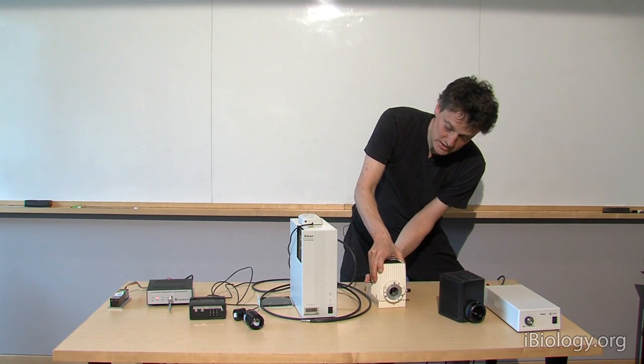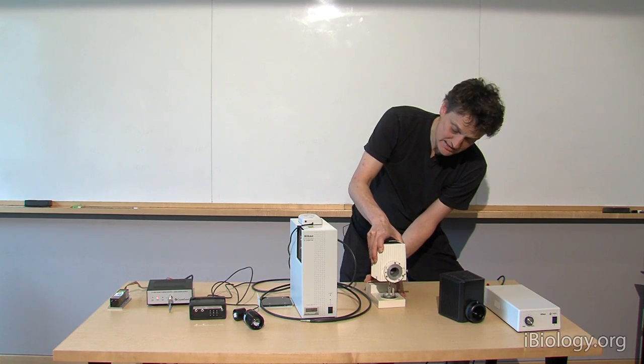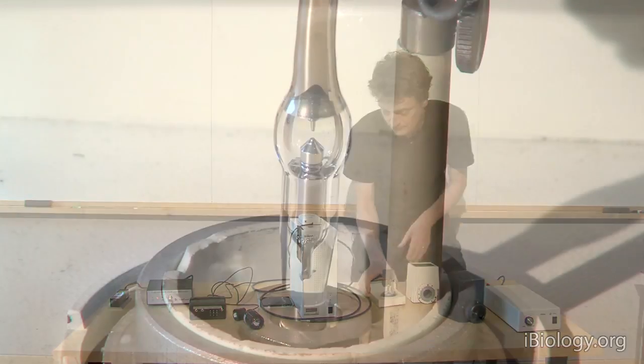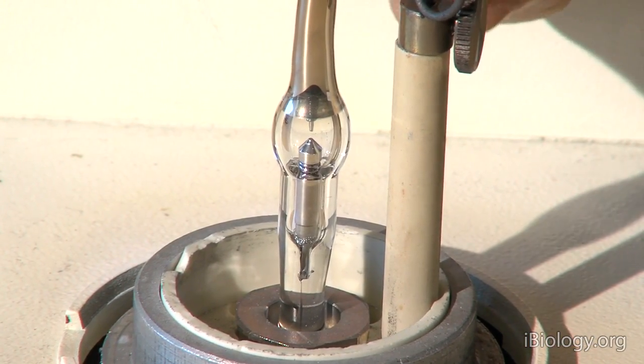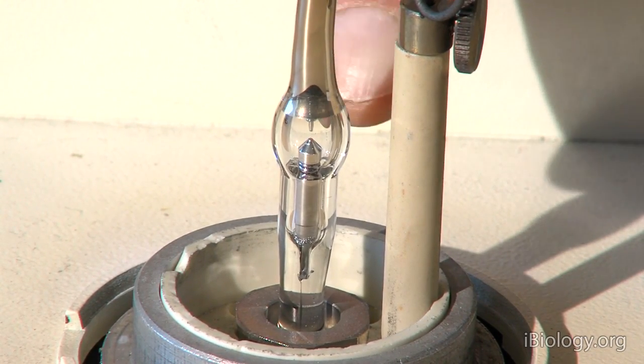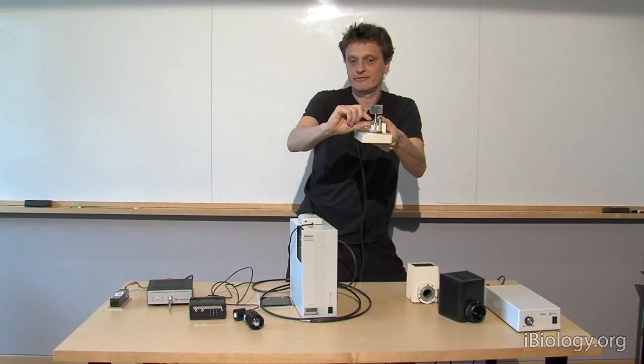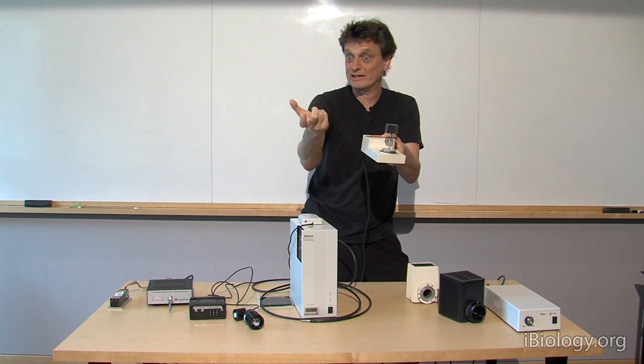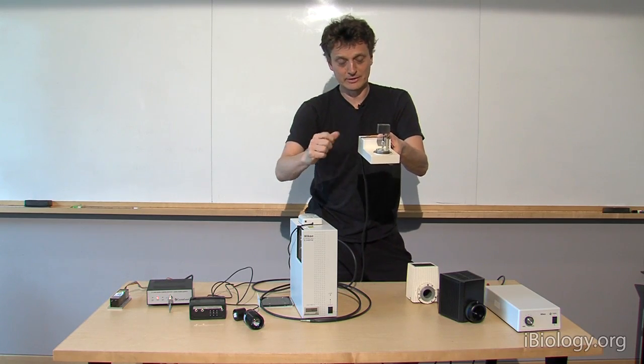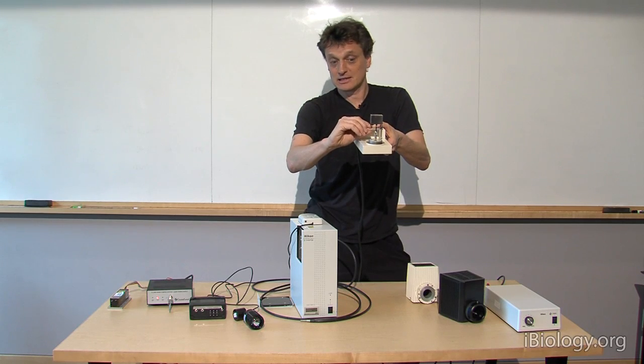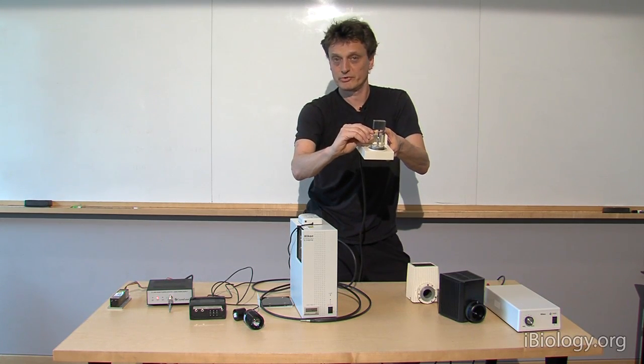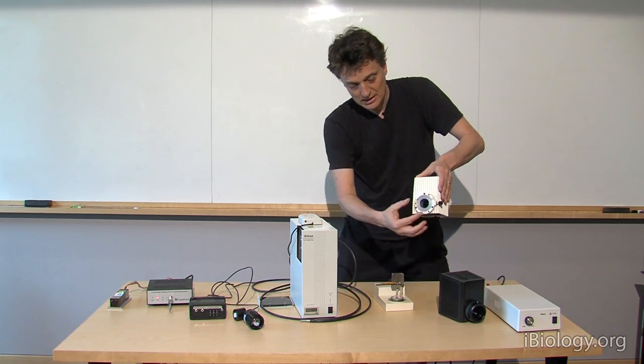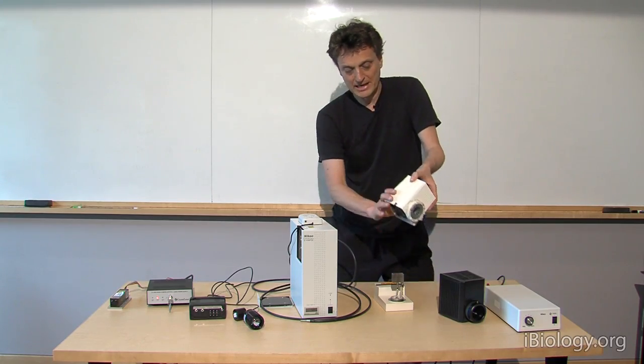A light source that has been used for many years in fluorescence microscopy is this mercury arc lamp. This is the bulb and in this bulb there is an anode and a cathode and a very high voltage is being put over this such that it forms an arc, just the same thing like when you are welding. This arc is super bright. That arc is then projected so the light goes in every direction through a condenser lens and reaches our microscope.